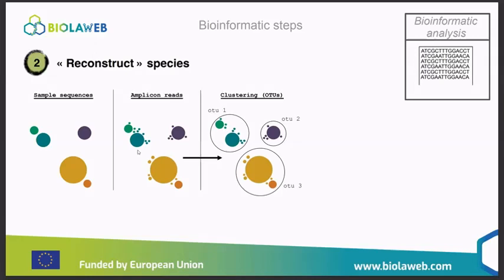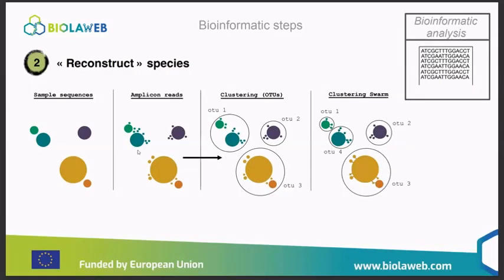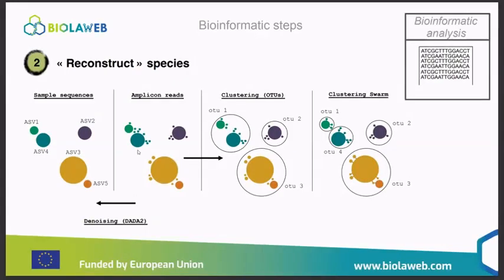Yes, basically, when we talk about sequence identity, you need to make an alignment of your sequences. You put the same position of, for instance, two species, you align them.